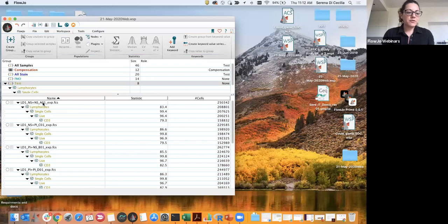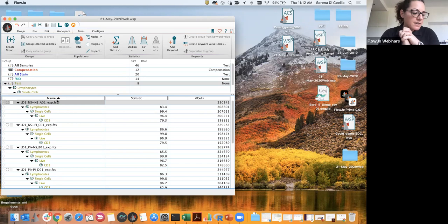Okay, perfect. So let's start talking about the different categories of plugins. So we have plugins for dimensionality reduction, and we have plugins for automated clustering, and we have plugins for quality check. We talked about plugins for quality check in the previous webinar.